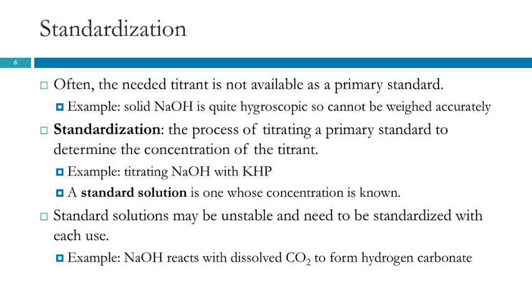And then we made the solution with the boiled water and stored it in a plastic bottle, right? So in theory, we're keeping most of that carbon dioxide away, and so we could store it that way. You'd still only be able to use it as a standard solution for a matter of days, because every time you open it, it's going to get some more air in there.